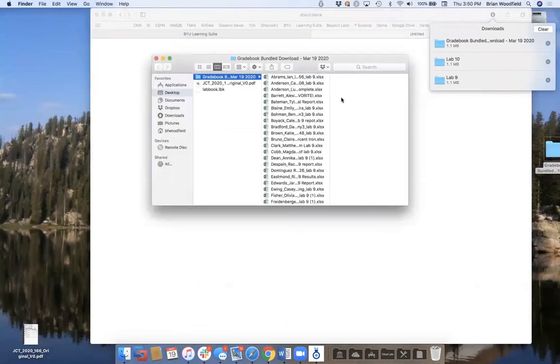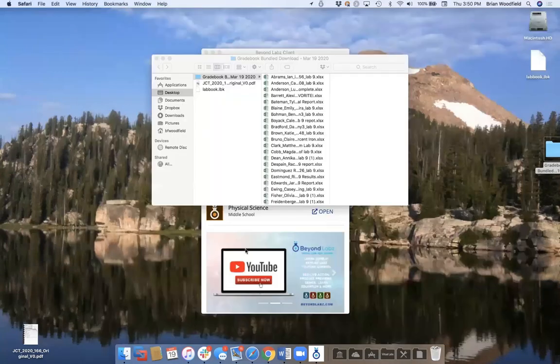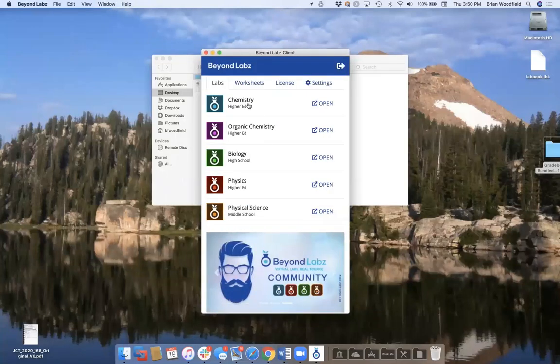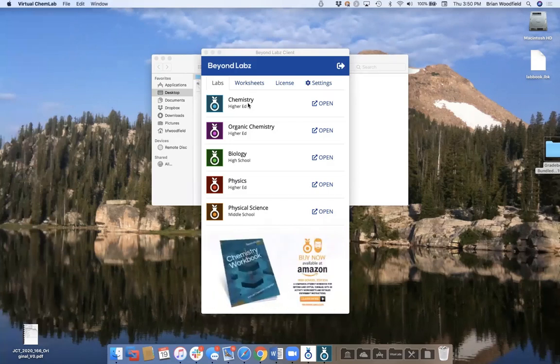And so I open this folder and it's got everybody's Excel spreadsheet, but this would be a lab book. And then it appended all their names, and all I would do is then go back to chemistry and have my TAs go do this.